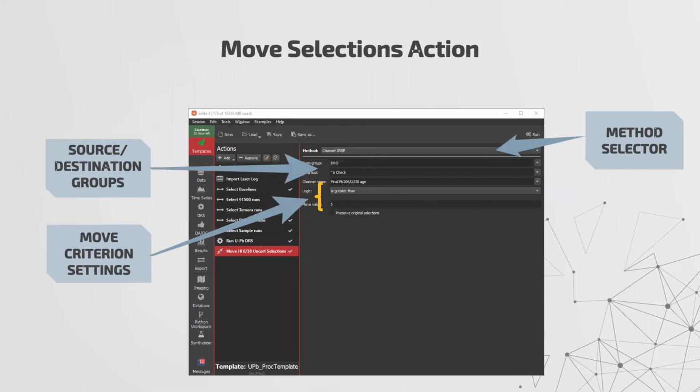So I've mentioned this briefly, and I wish I had more time to discuss this, but one way to think about your experiments is that you can mark your samples as being either clearly okay because they pass certain criteria, and then you can create groups with selections that are in the maybe okay pile, and then you have another group that's in the no, this is definitely bad pile.